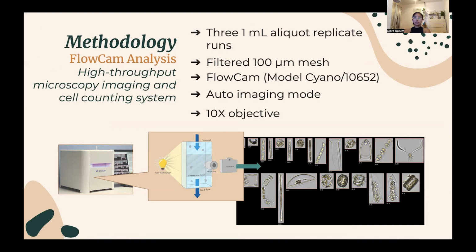There's usually a lot of debris within estuarine samples, especially due to the nutrients. But you're able to use the program to automatically sort it. To do this, you need to create libraries of specific images. A filter can then be generated from that library with its statistics of different variables, morphological variables such as area, diameter, and even symmetry. And you can apply that filter to different samples, which it will then sort out automatically based on that filter.